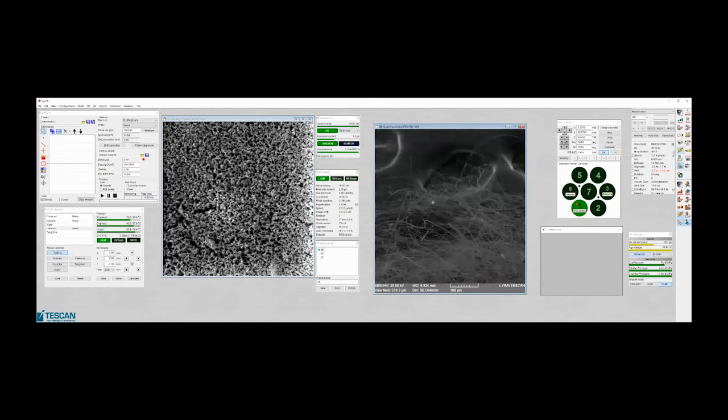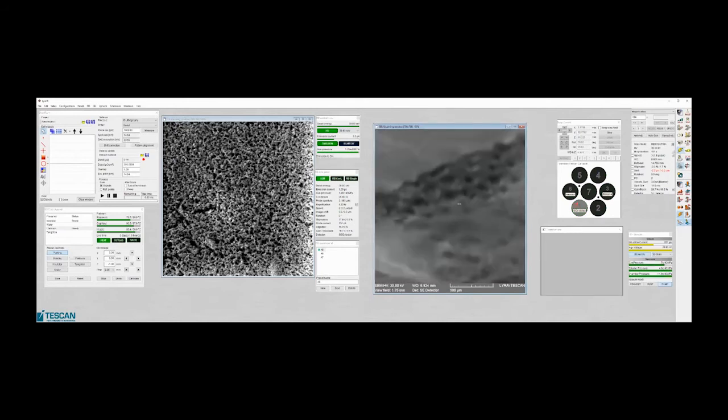We have the possibility to pick up one of them by the tip. So first of all, I will move out and I will show you the tip. We have to find it if we have it. So here you can check it in the chamber view on the right side.